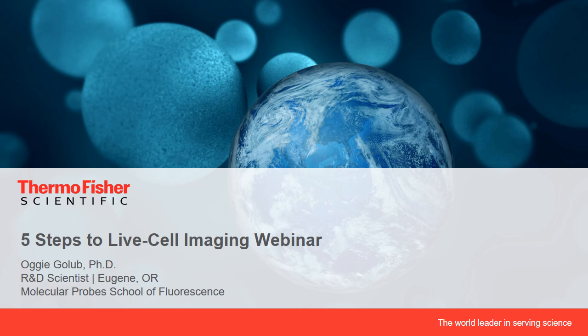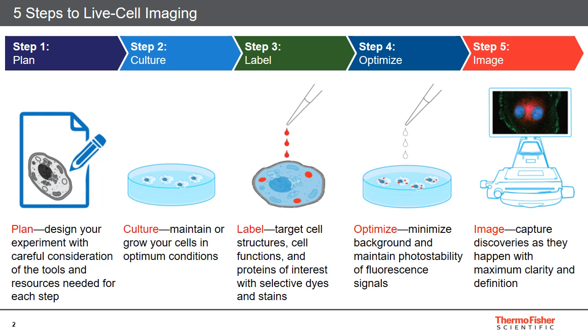Today's webinar will be solely focused on live cell imaging using fluorescence. A specific breakdown of the topic will be presented in a manner where we'll cover what we refer to as the 5 steps to live cell imaging. The 5 steps to live cell imaging will essentially serve as an outline for the remainder of this talk.